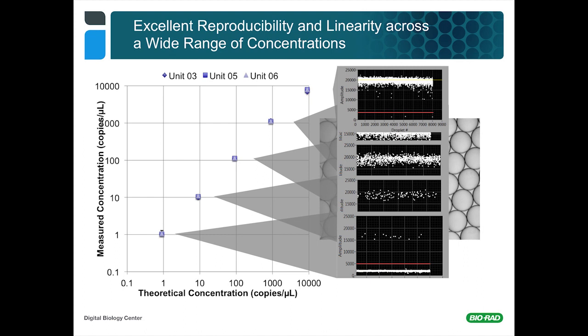As you get towards 10 copies per droplet, as I mentioned, you've converted almost every droplet to a positive droplet, although there are still about 3 remaining ones beneath the red line that you can see there. So that's pushing it a bit further than we like to. We recommend normally not going beyond about 5 copies per droplet, where there are several hundred negative droplets still available. And what's striking here is that it's basically a perfect R-squared across these 4 logs.